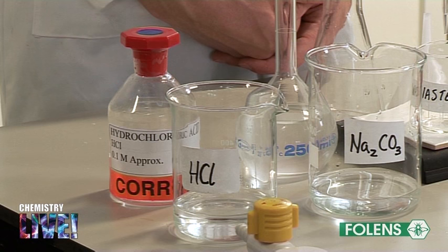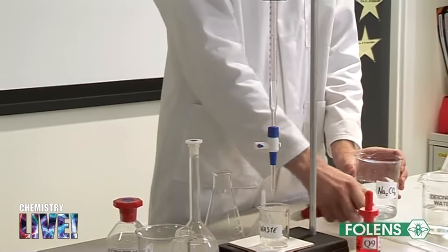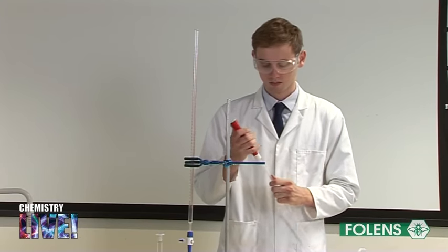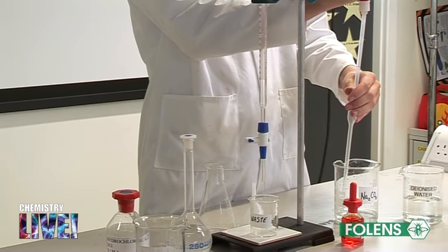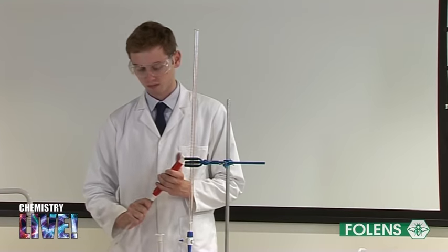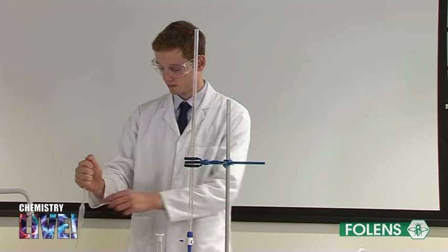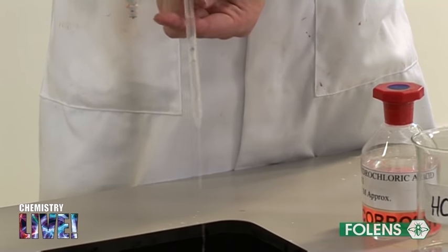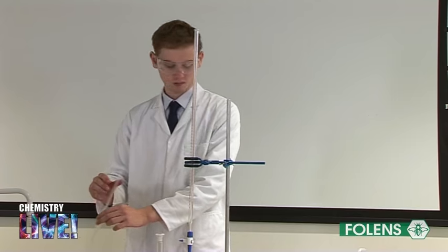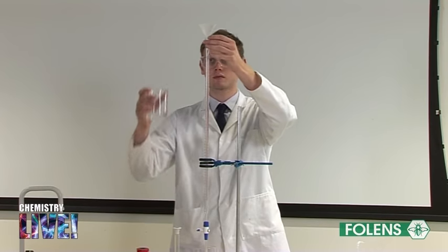We now begin part two, in which the pipette and burette will be rinsed out with the solutions that they will contain. Rinse out the pipette with some of the sodium carbonate solution. Rinse out the burette with some of the hydrochloric acid solution.